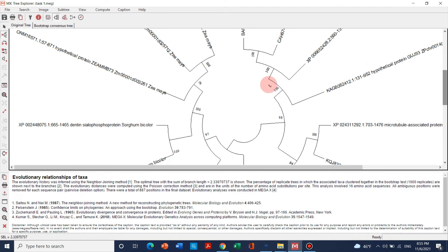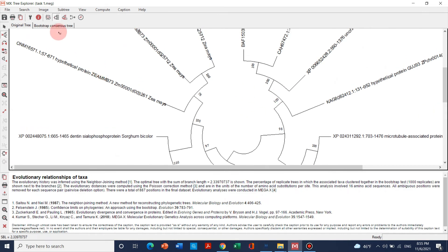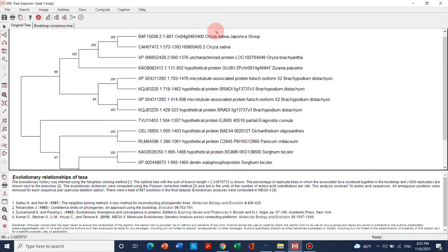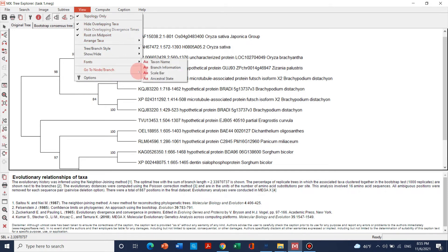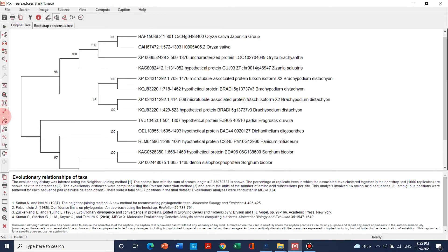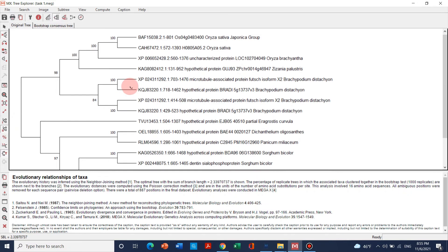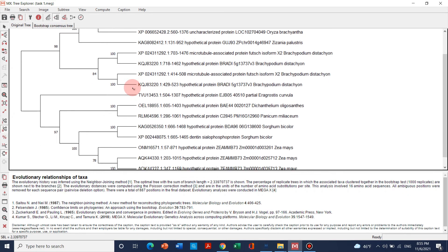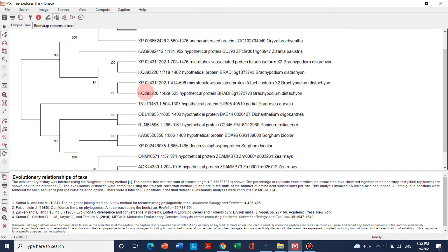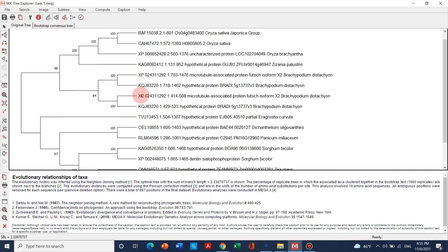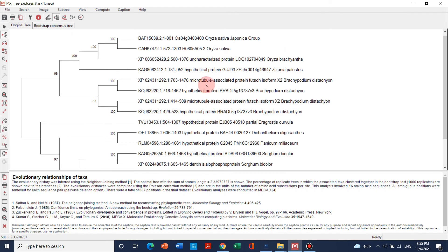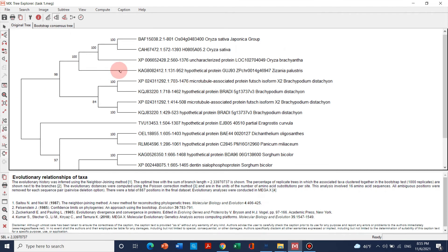If we want other display options we can choose them — for example, a circle showing distance and names. We can also choose rectangle, traditional, straight, or curved options. I personally prefer the circle view. We can also change the name, text, and color of the figures. Under View we can change text, name, branch information, scale bar, and other structural elements. We can also zoom in and zoom out. I personally use an online website that I will cover in another video tutorial — it is much more beautiful and easier to use with more color options.